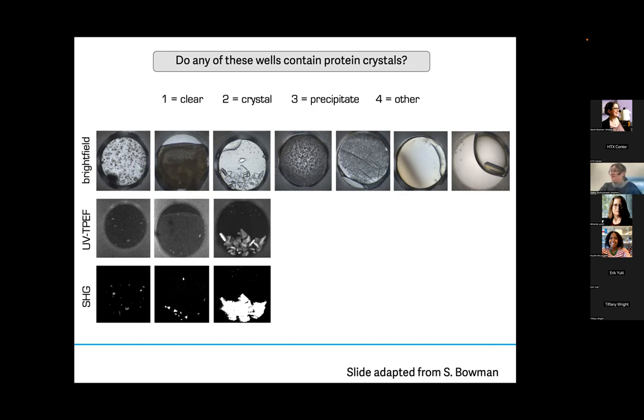All right, well, number 3, everyone says protein crystal, and I'm going to agree with you guys. That is a bunch of beautiful protein crystals. They look gorgeous on the SHG and so beautiful on the UV. Love that.